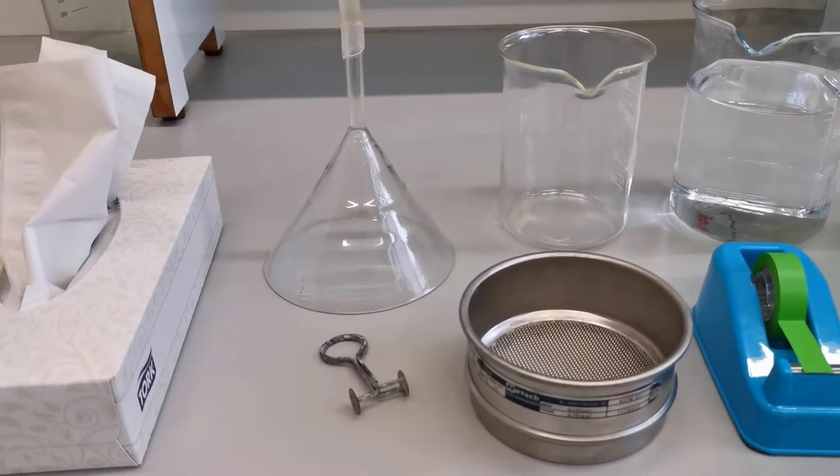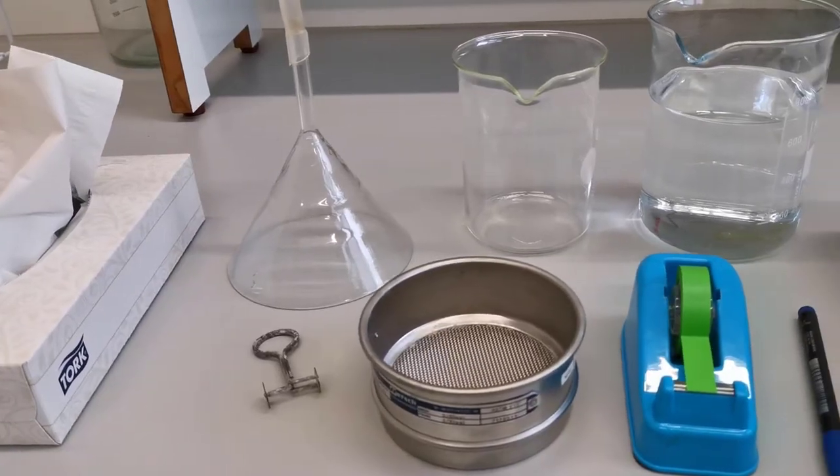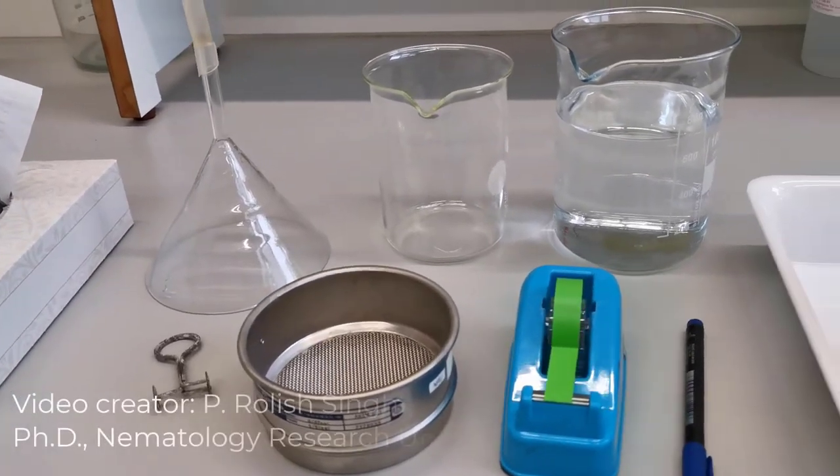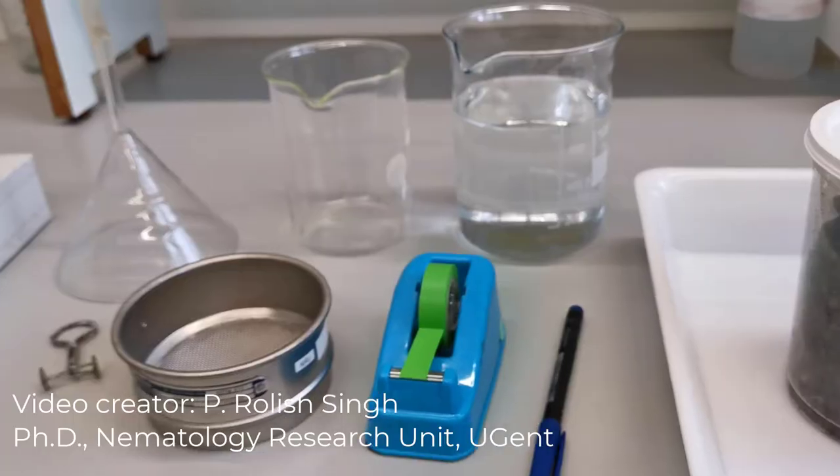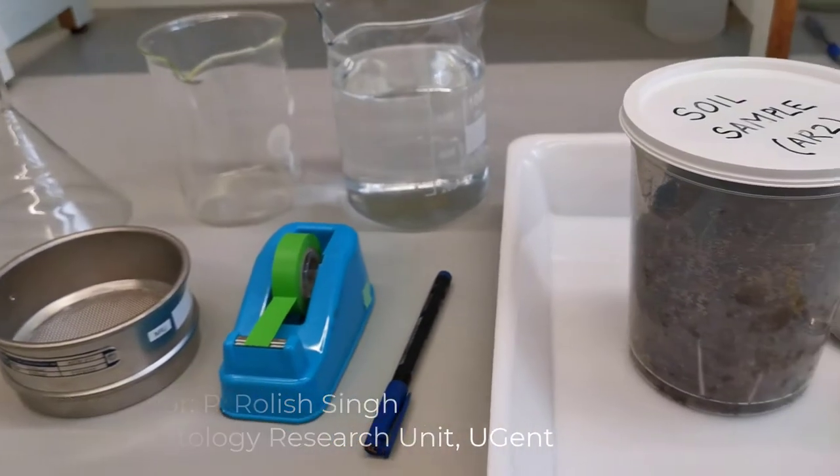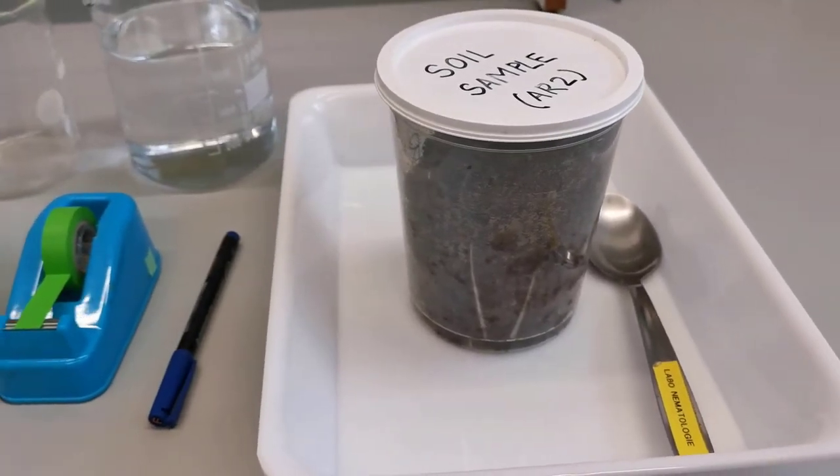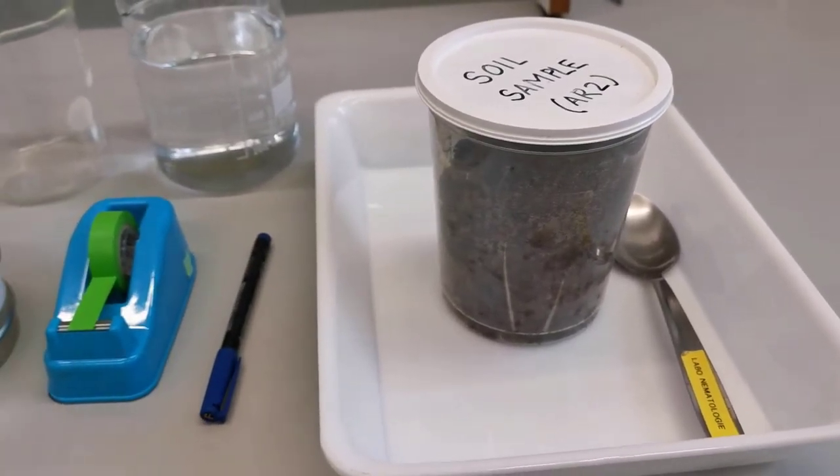Baermann funnel extraction of motile nematodes from soil or plant materials requires a setup of a funnel with rubber tube attached to it, a clamp, a sieve with 850 micrometer mesh size or bigger, tissue paper, some tap water, beakers, leveling materials, etc.